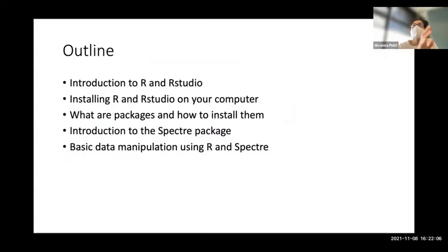So today I'm just going to give a little bit of a presentation first, introducing everyone to R and RStudio, just briefly how to install them, what packages are, and what functions are, which are essentially hosted within a package. And then after that, I will go through a quick demonstration on doing some basic data manipulation using R and Spectre. And then after that, we'll give about an hour or so to everyone to play around with the code, basically the session 1 script that Tom has uploaded, and ask questions, of course. So let's start with that.